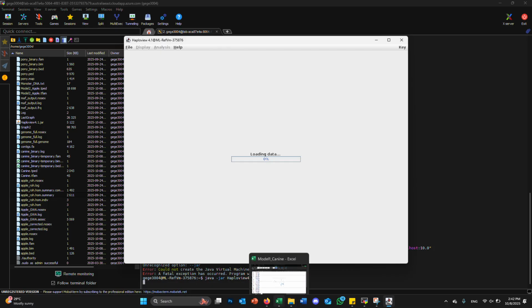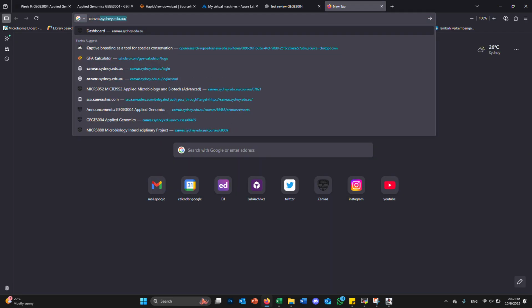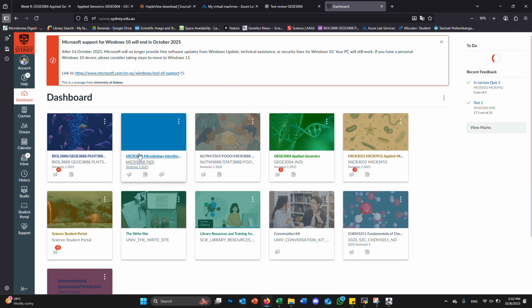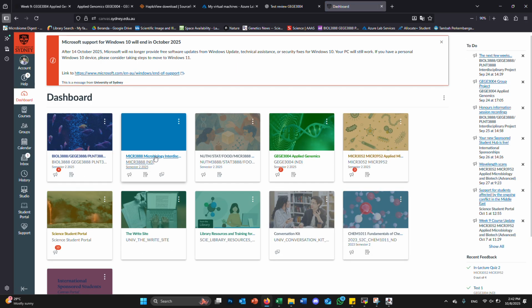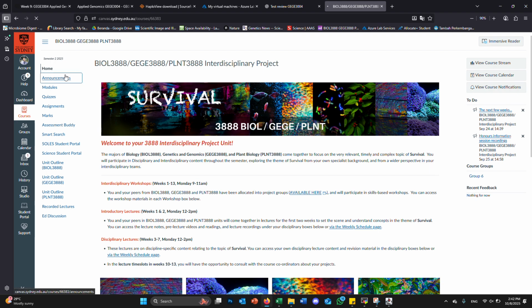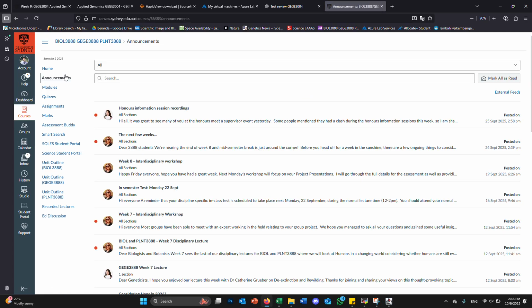You can sort your output files, and the lowest p-value is the most significant. Find what location that is at, and look at the paper on apples, which has a Manhattan plot. You can see whether your top marker is also on the chromosome of the top marker. If it is, then you know that's right.